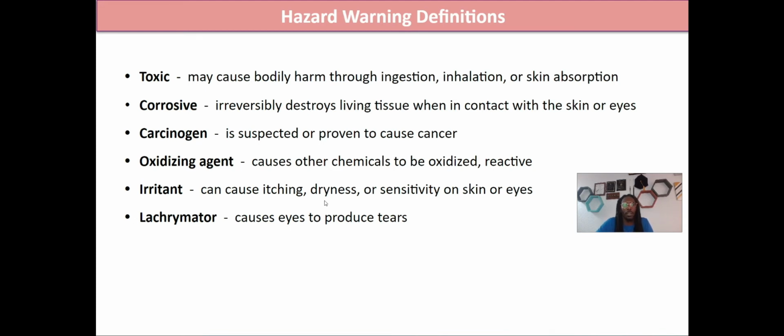Irritants are basically going to cause you to be itchy or cause your skin to be dry or sensitive. So definitely avoid those irritants. And then lacrimators, they cause you to cry. So these are some common hazard warning definitions that you're going to be seeing, at least in this course here.